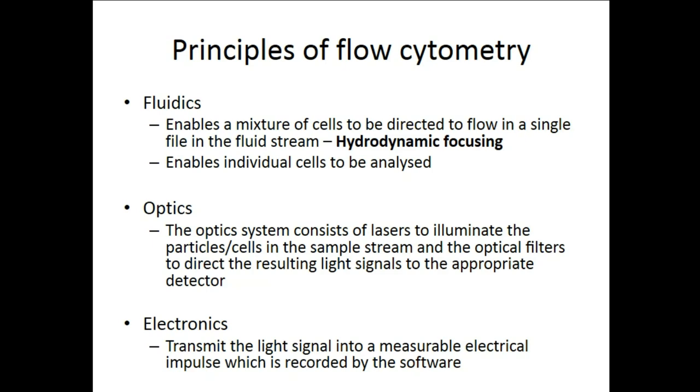And the last aspect are the electronics. The electronics transmit the light signal into a measurable electrical impulse, which can then be recorded by the software.